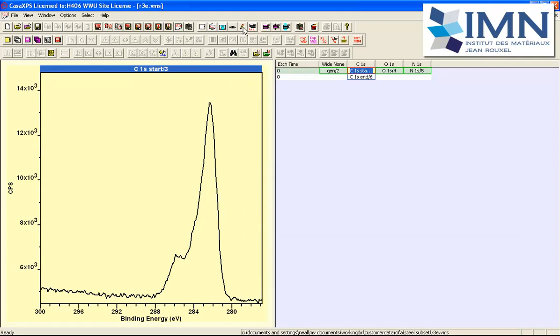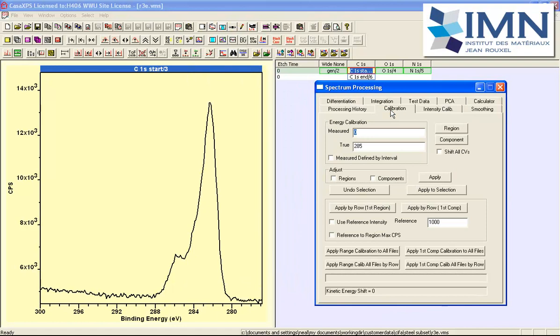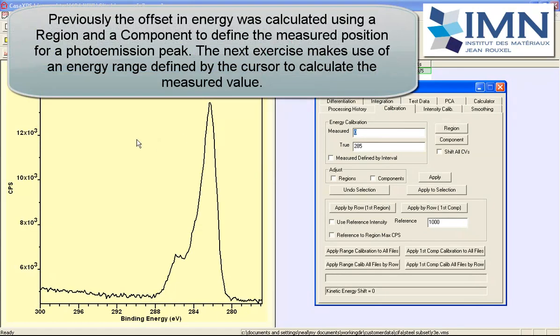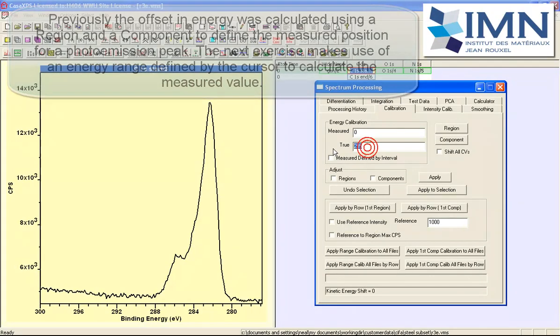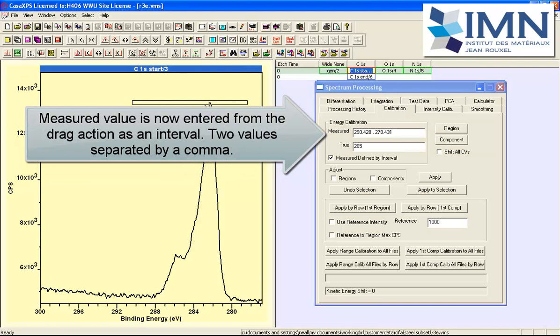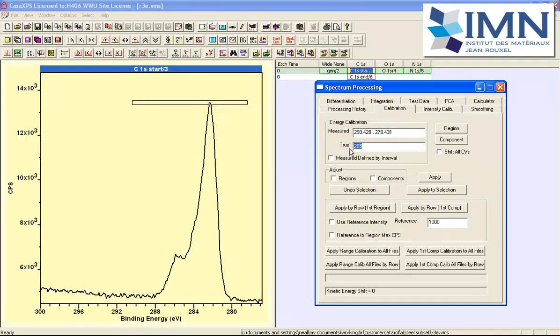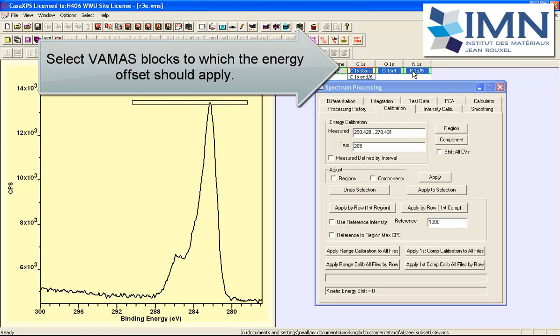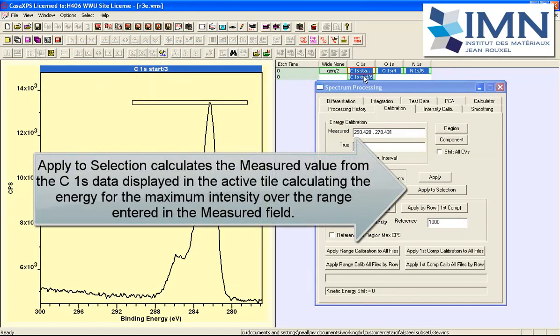So we'll start off by looking at one of these carbon 1s and then using the calibration property page we're now going to correct the offset for this carbon 1s assuming a true value of 285 and we use a measured interval which is indicated by drawing out a box and it fills in on the measured value two binding edges that correspond to the start and the end of this box and this will give us a range of which the maximum value can be calculated and therefore the measured value is coming from the data. The true value is just the value that was entered at 285. And then if we select these three spectra here and in fact we'll do the same for the fourth one here because these are all effectively measured at the same time, then we can say apply to the selection.